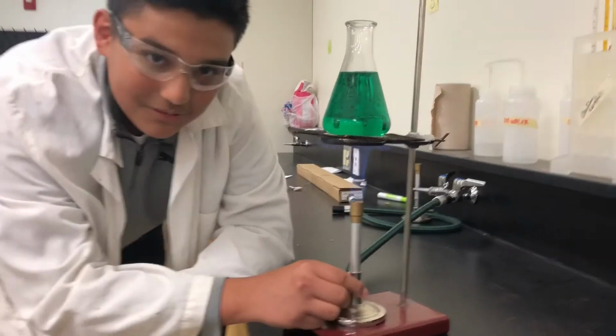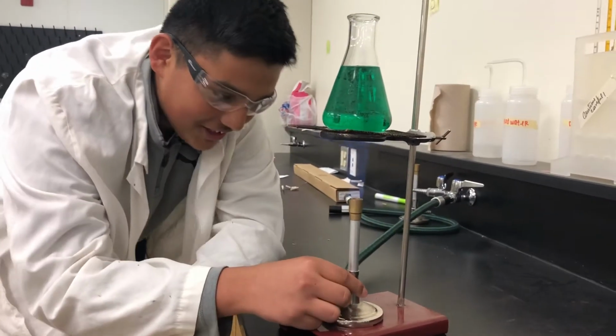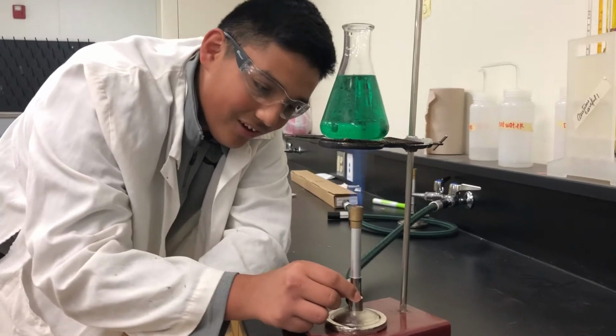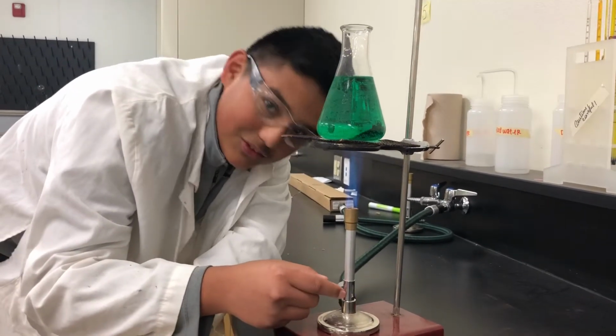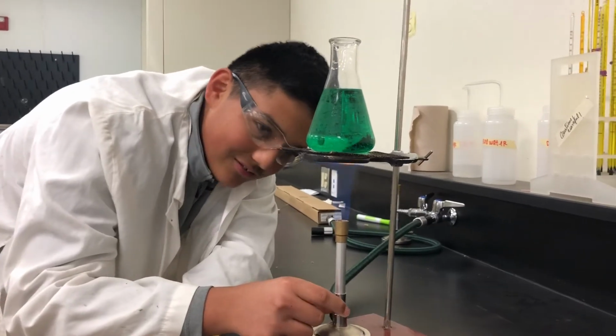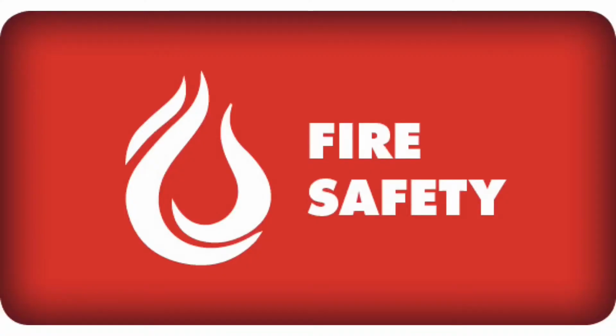So when using your Bunsen burner, you want to change the airflow by twisting this valve. To get it to a roaring blue flame, you twist it all the way open. In case of any accident or emergency, quickly shut off the gas.